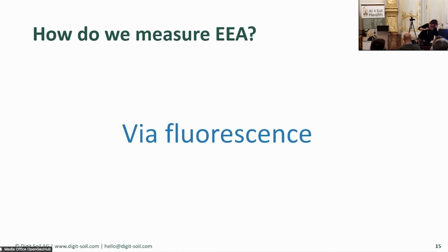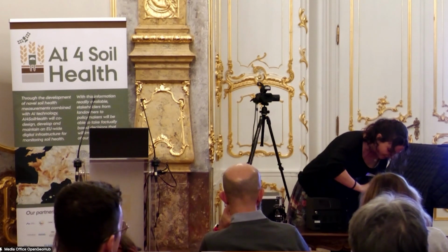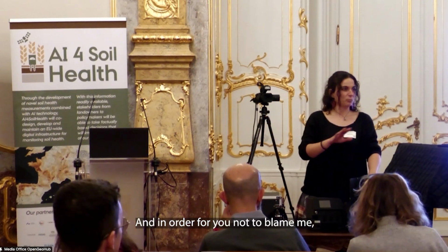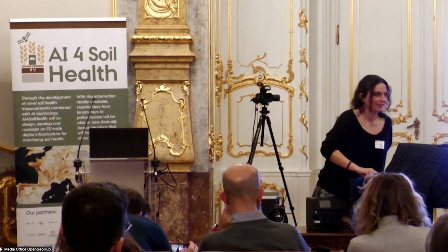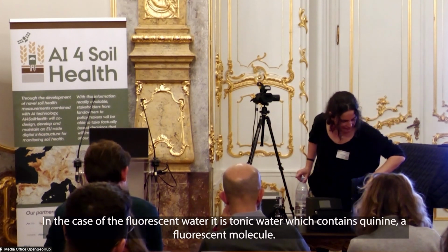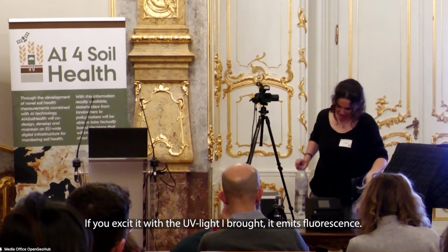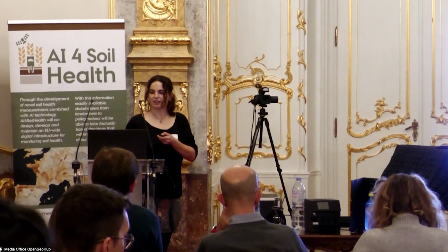So, for example, I can use this. This is quinine, but be sure we don't measure with tonic water.